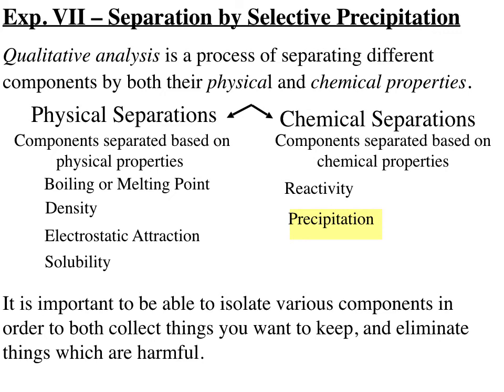This week's lab, we're going to do a separation process. This is often referred to as a qualitative analysis. It's qualitative in the sense that we will find out what we have present, but we won't find out how much of the things we have present. You have to use other techniques to quantify how much of each material may be present in a chemical reaction.